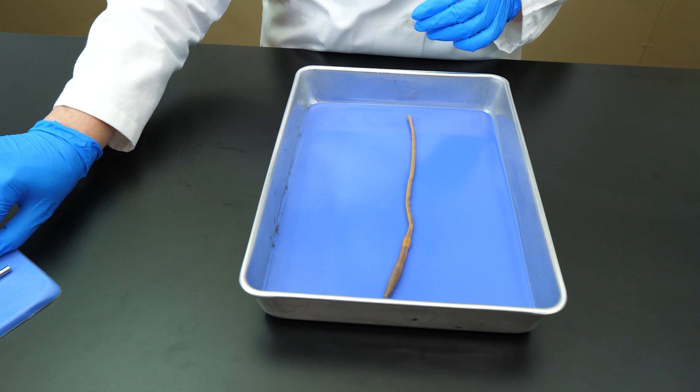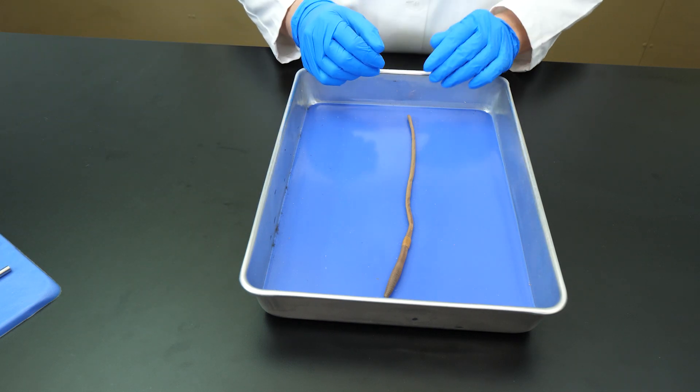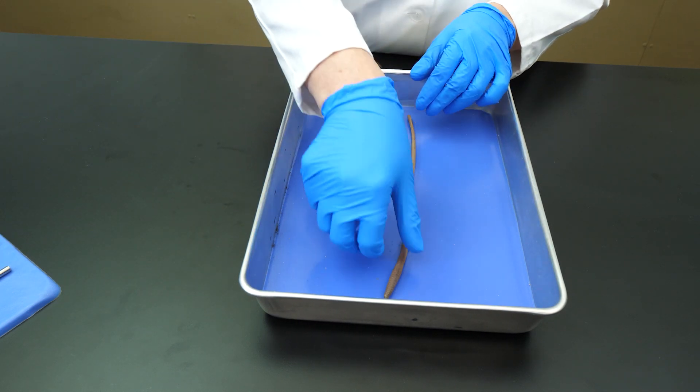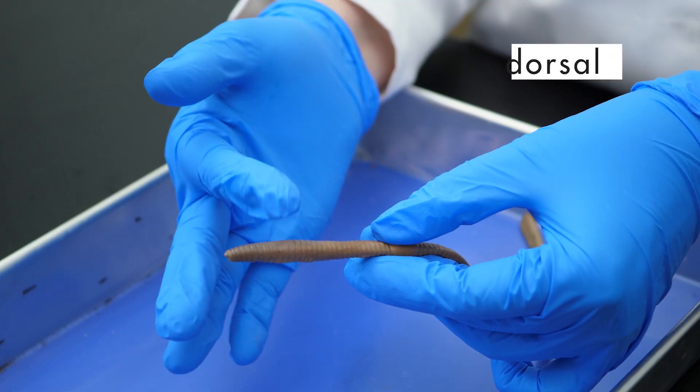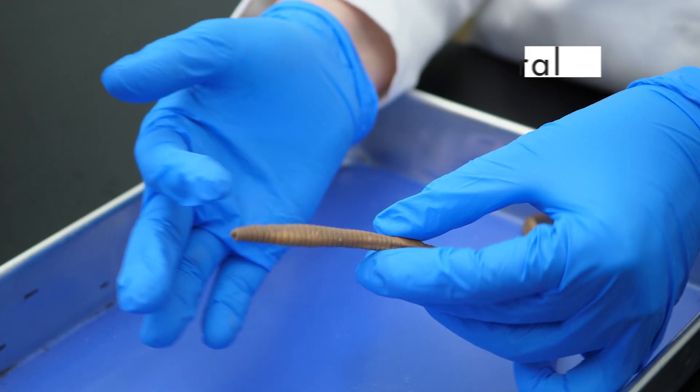We also need to identify the dorsal and ventral sides of the earthworm, because we will make our incisions on the dorsal side. The dorsal side is darker than the ventral side.